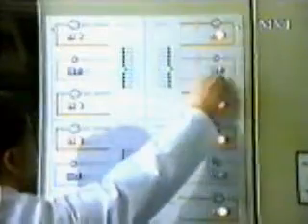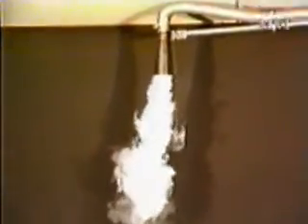This particular room is equipped to be able to adjust the airflows, and with the aid of smoke generators and special lighting, the program visualizes the effects of different airflows and the relationship between air, the room, work surfaces, heat, and people.